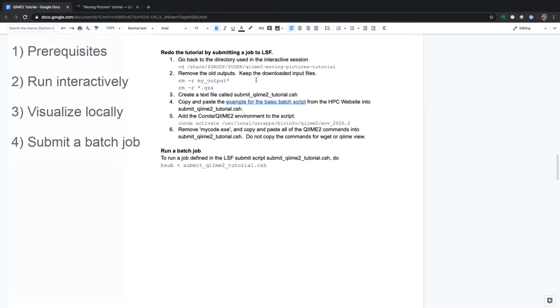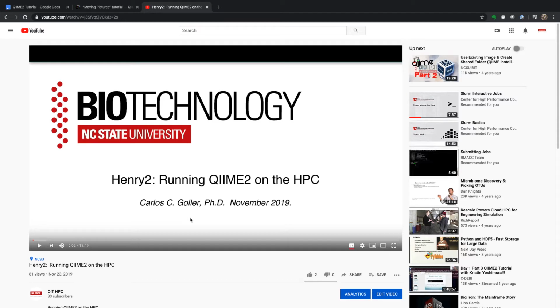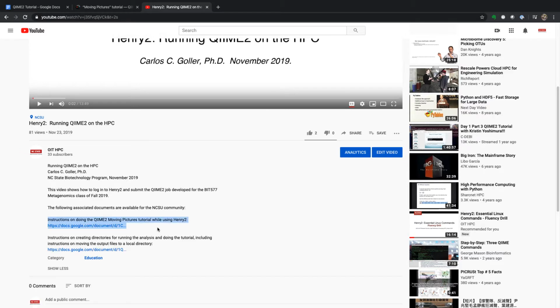You need this Google Doc. Where do you get it? You can find this Google document from the page that you're watching this video from. If you scroll down, under the description, click Show More. This is where we're going to put the link to the Google Doc. Let's try it out.